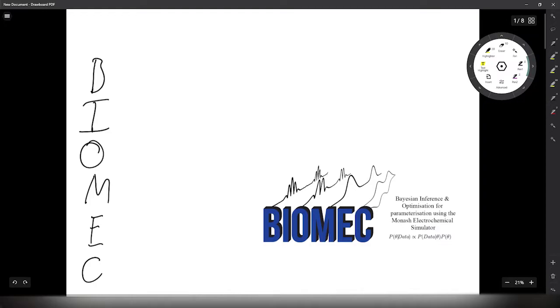And this can be found on GitHub, and it can be downloaded and installed for any computer device. It runs in a Singularity container, but it should be able to run on any Ubuntu based system, either on a supercomputer or on just any free install Ubuntu, which you can very easily install. Well, not easily, but you can get it and install it on your computers.